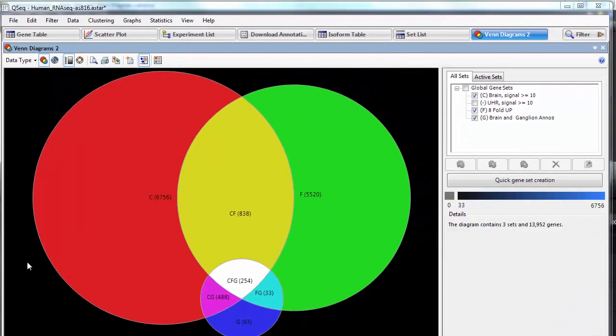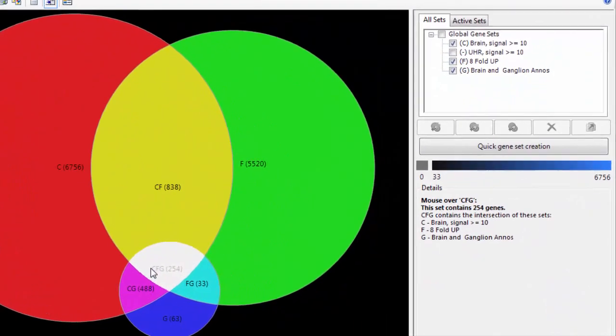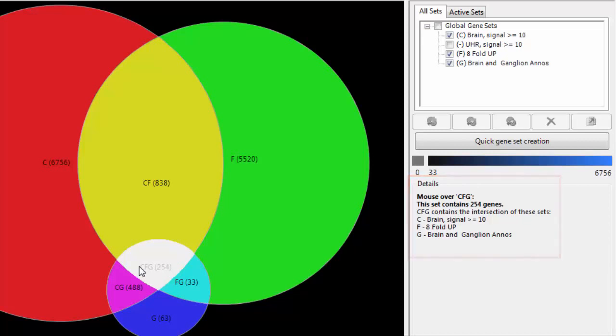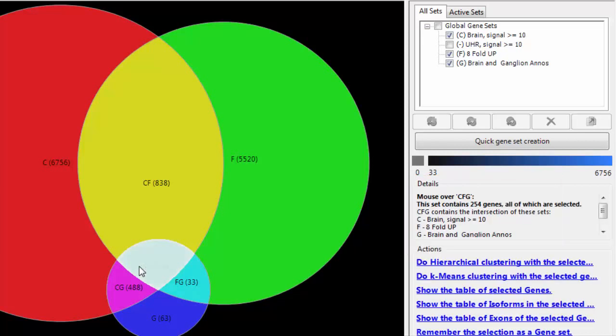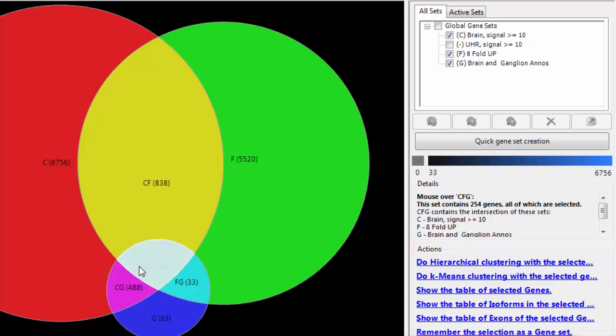To see details for a section, just hover over it, and information will be displayed in the Details section of the Info pane. If I click on the section, that will select those genes and provide action links to perform various functions such as clustering or showing the selected genes in the gene table to view additional information.